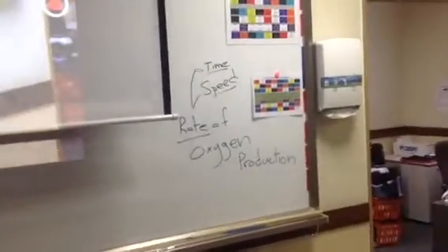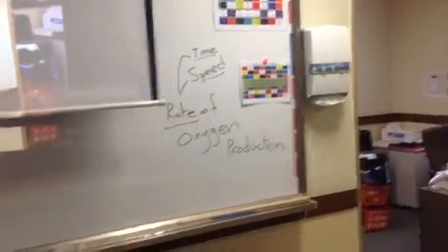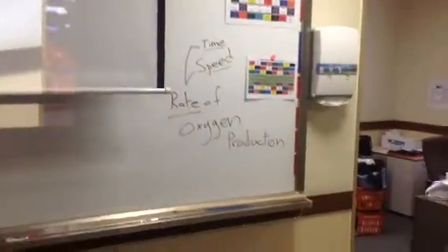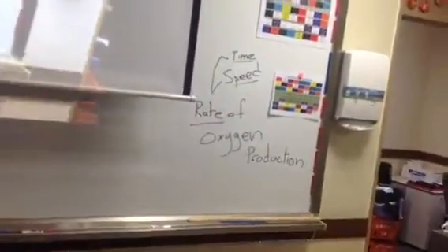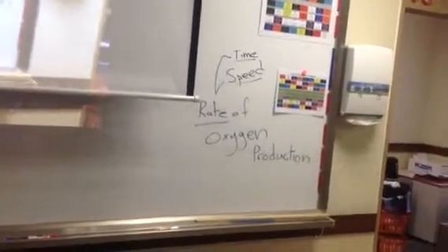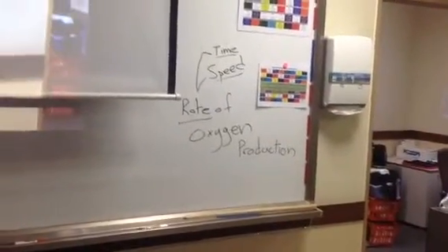Maybe the speed as well, like how long it's going to last. Well, you're using the word speed again. How long does it take to see all the bubbles? To give all the bubbles? Yeah. Okay. Into another tube.